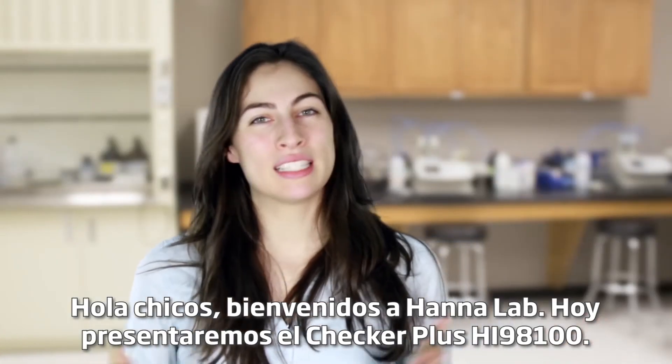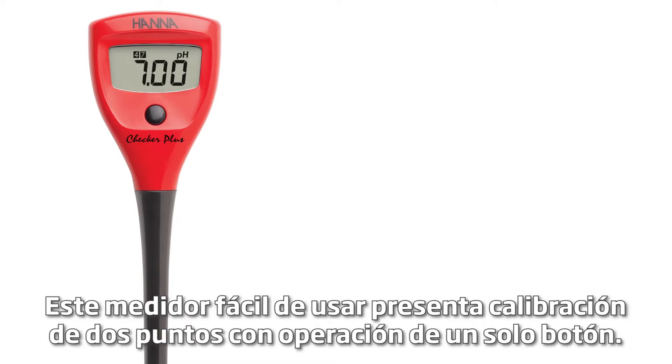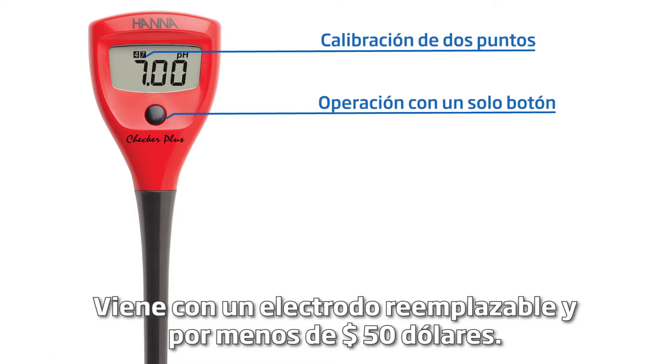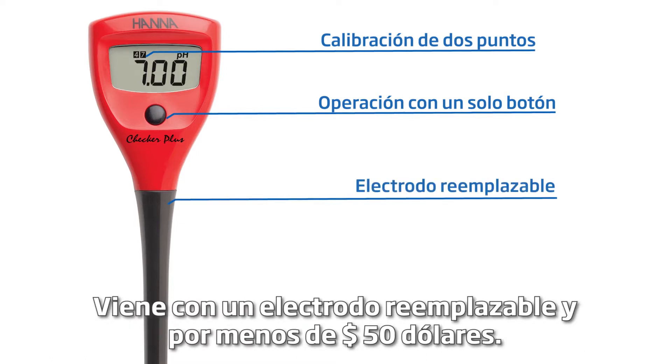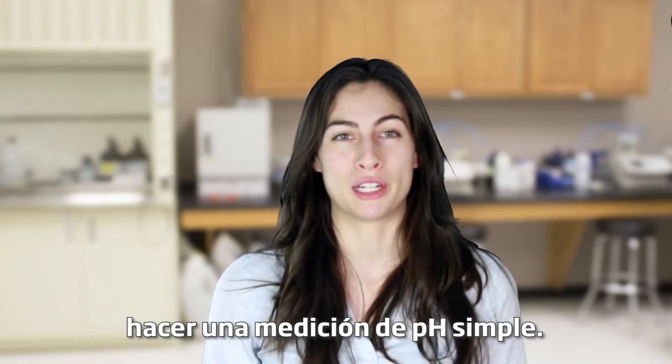Hey guys, welcome to the HANA Lab. Today we'll be featuring the HI-98100 Checker Plus. This easy-to-use meter features two-point calibration with one-button operation. It comes with a replaceable electrode, and for under $50 it's a perfect tool for any business or hobbyist looking to do simple pH measurements.